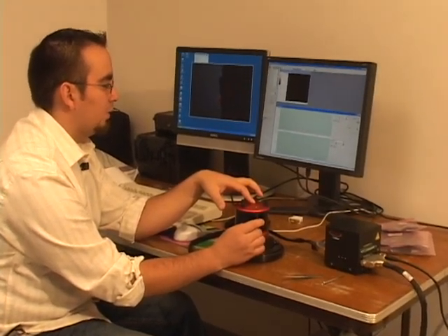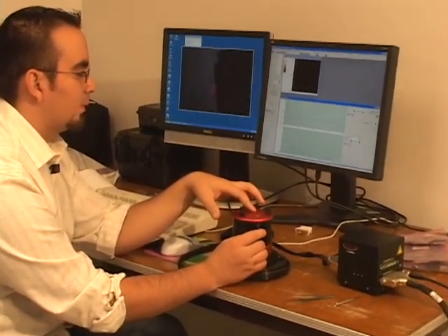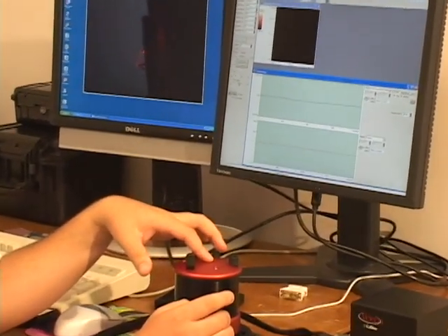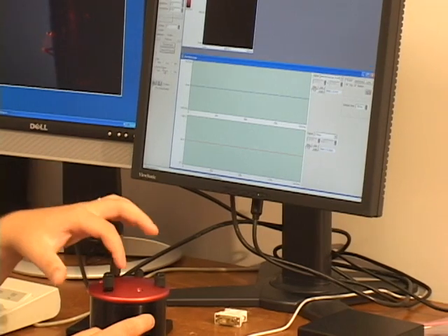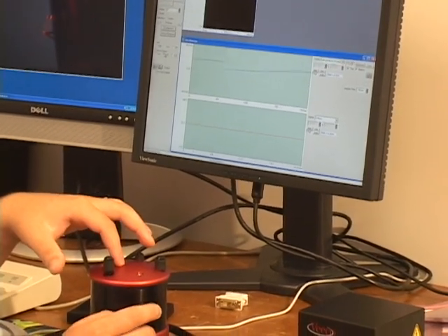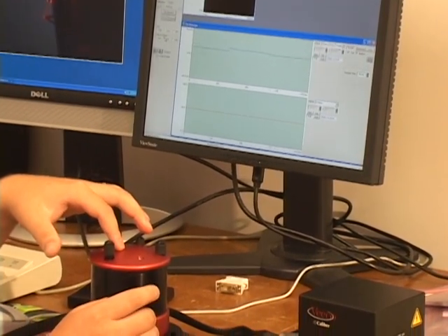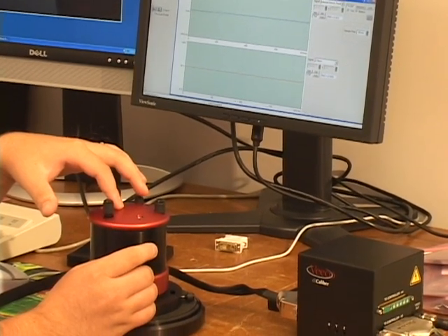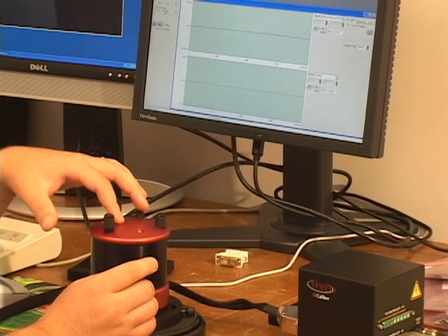And we want to get that one till it's 0. And not only that, you want to make sure it goes through 0. So we might be able to get to 0, but you want to make sure it can go through it and go beyond 0. So after you verify that it can go through 0, bring it back down. Leave it at 0.